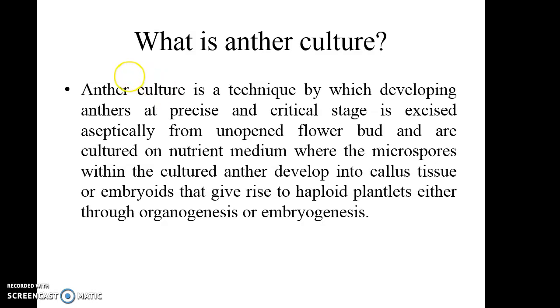Then the excised anther you can culture on the nutrient medium, where the microspores present in the anther can give rise to callus tissue or embryoids. The callus tissue may give rise to organs or embryos, and ultimately that will develop into haploid plantlets.